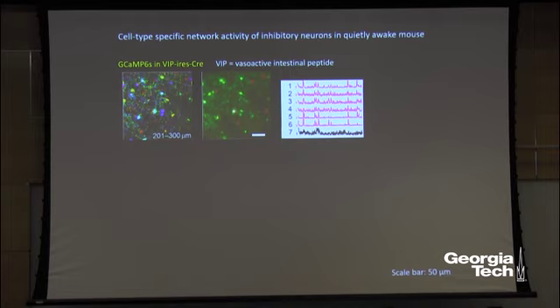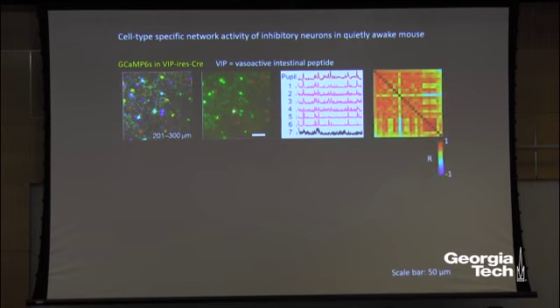And it turns out that my postdoc was doing something that we, again, didn't really know why we were doing it, but he was just monitoring the pupil diameter of the mouse. And then what we saw is that this spontaneous activity is very much synchronized with the pupil diameter. And this is just the correlation coefficient matrix. You can see that it's extremely highly correlated.